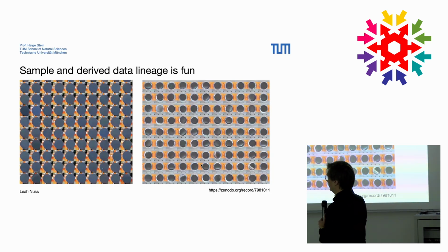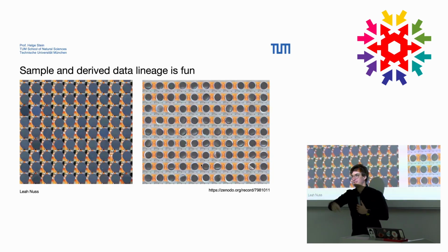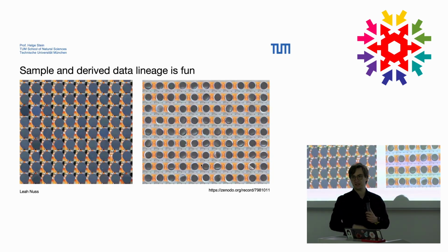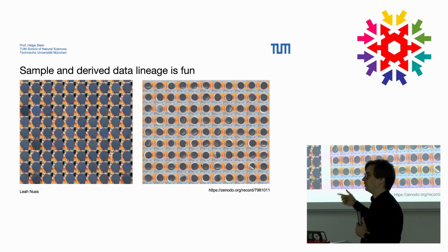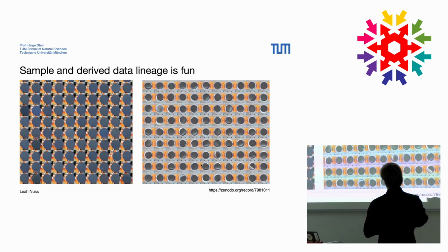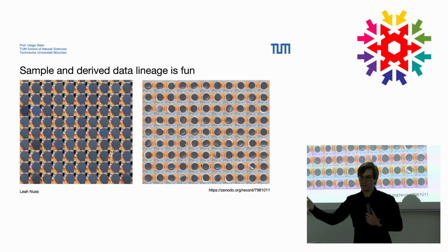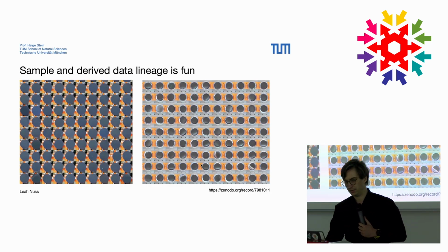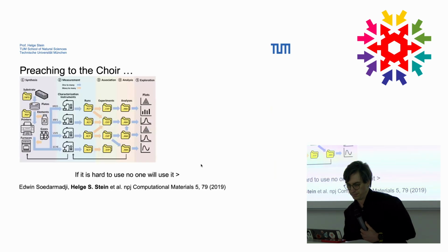We know which cell this is. So if we see during the formation or during cycling some weird electrochemical behavior, we can actually go in and pinpoint it to some certain kind of defect. Or if the electrode is weirdly wrinkled, we typically see this in the electrochemical data. And of course, we always put this online if we are allowed to share it.